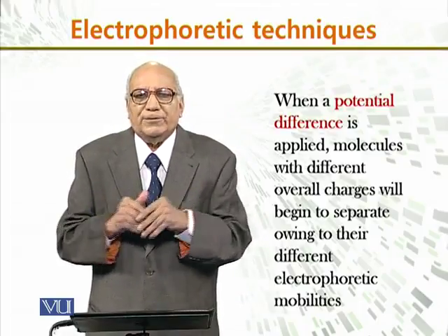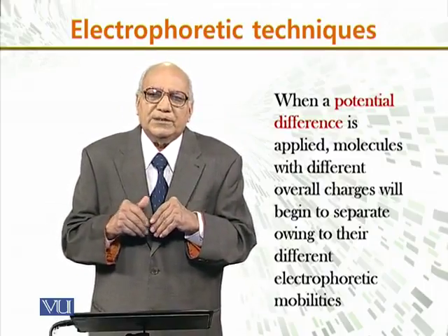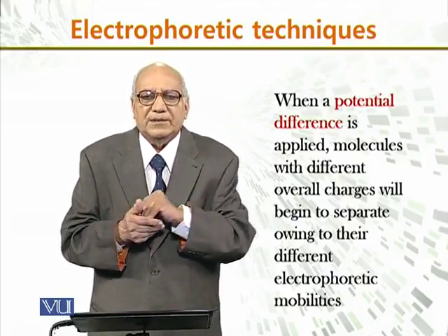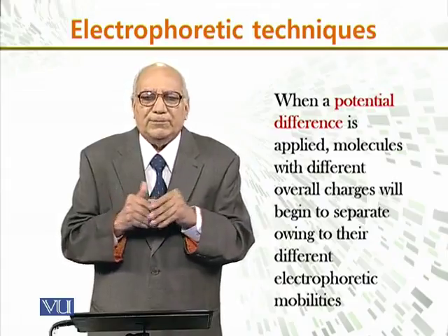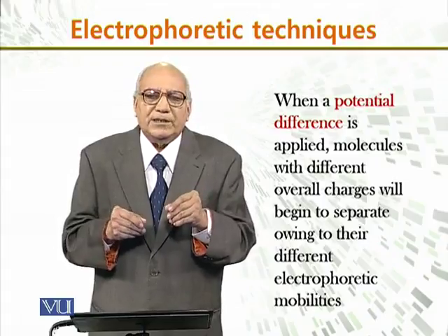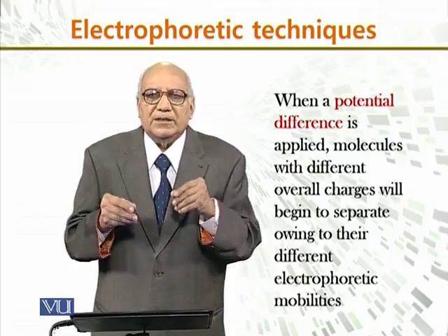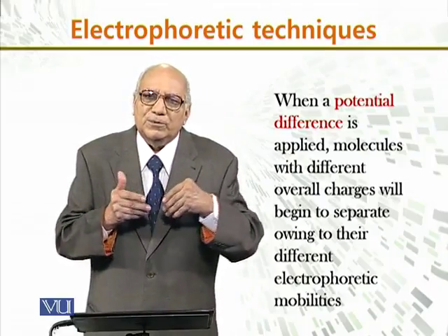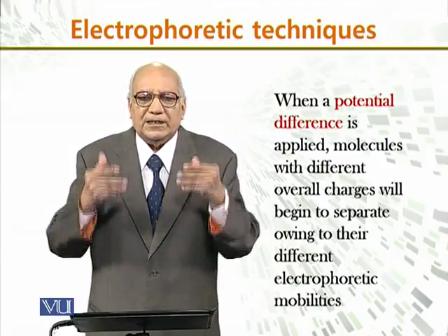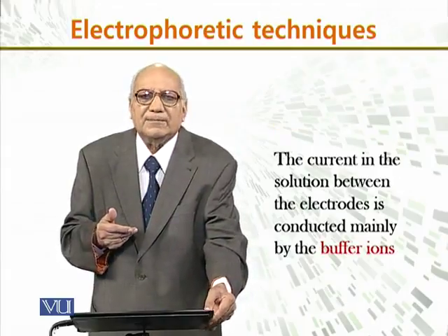When a potential difference is applied from the power supply, molecules with different overall charges begin to separate owing to their different electrophoretic mobilities, that is, their size, their charges and so on.